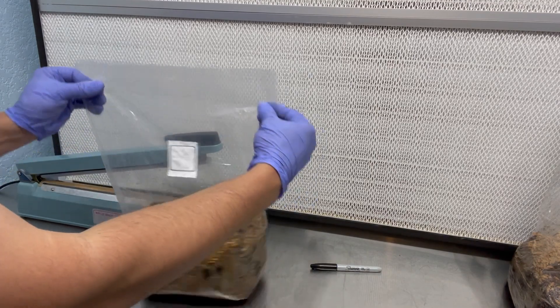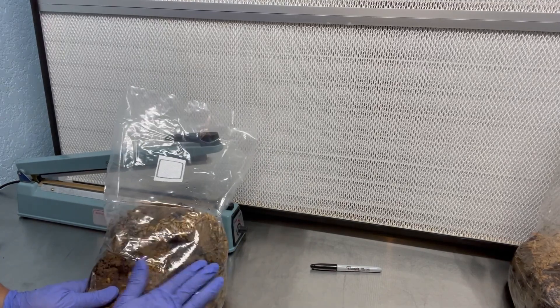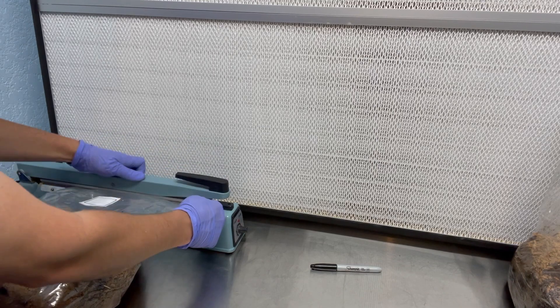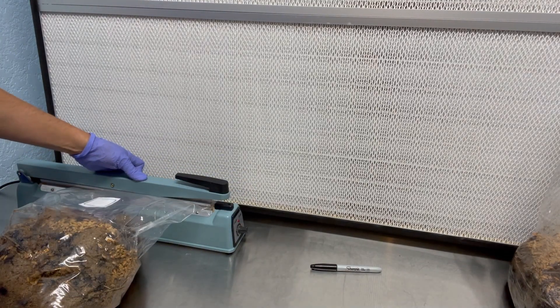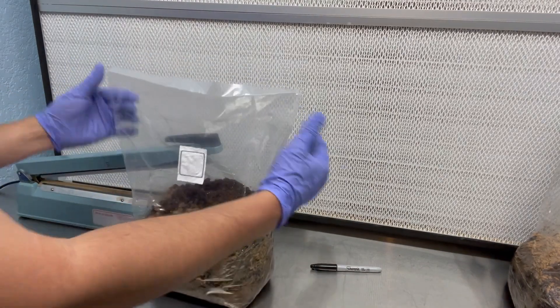So I just inoculated the substrate with some grain spawn and I'm going to mix that through the bag. Before I do that, I'm going to heat seal it with the impulse sealer in front of a flow hood. This will prevent any contamination from getting inside of the bag.